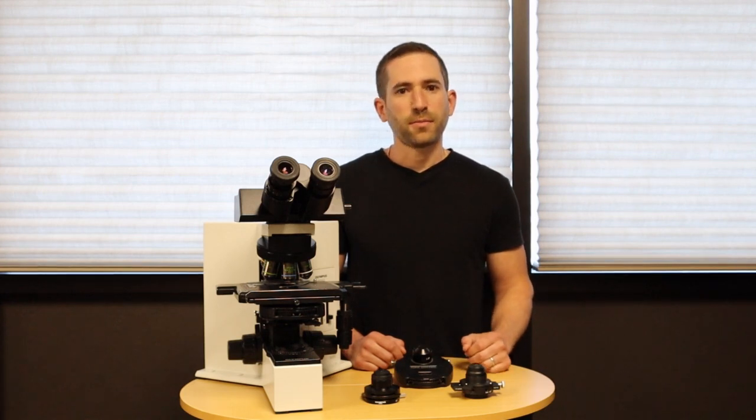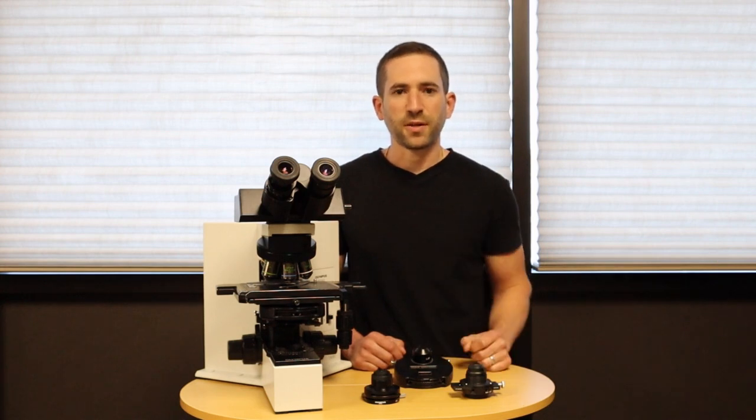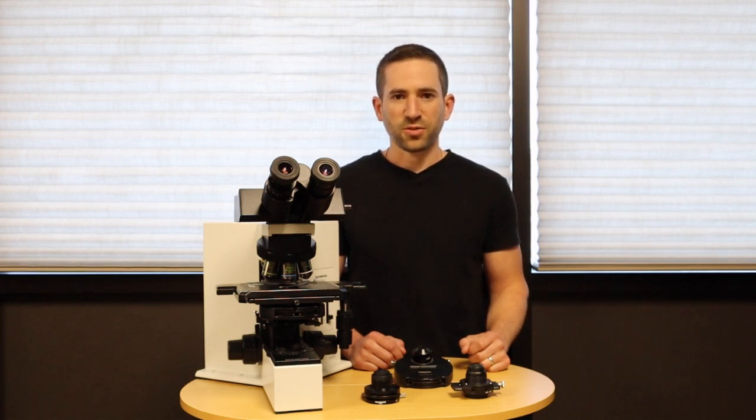How a phase microscope works is essentially each objective has a different size ring inside of it. You must match that ring to what's called a phase annulus that gets inserted in some manner below the stage of the microscope.